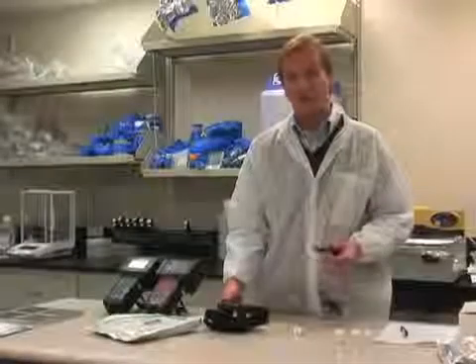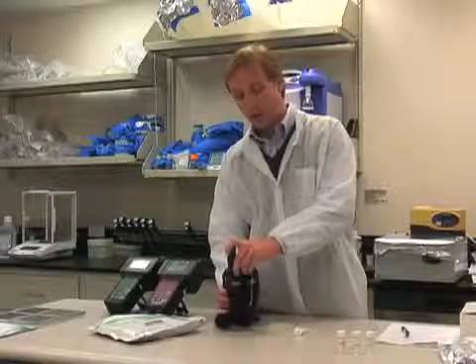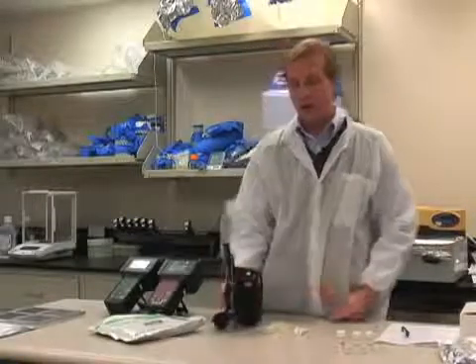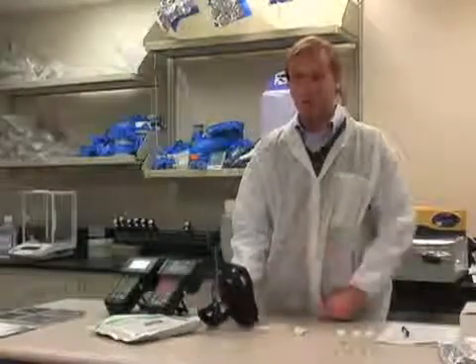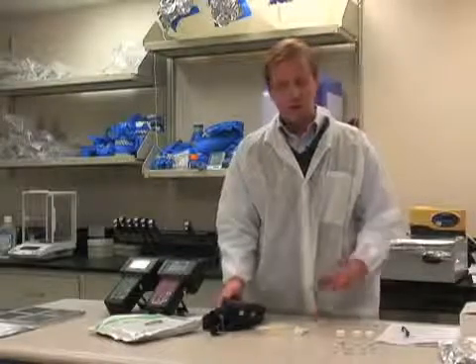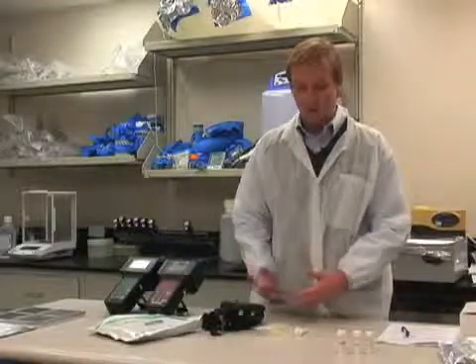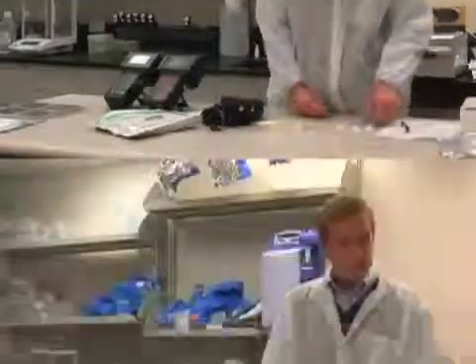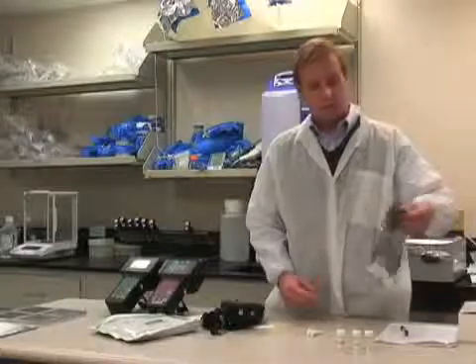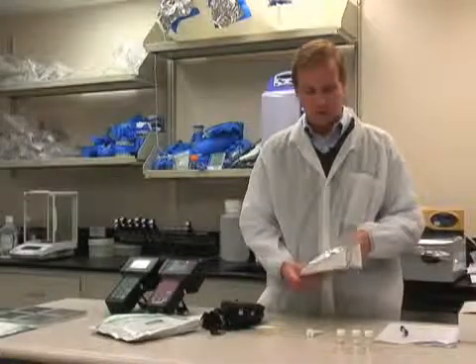So now that you understand how the Charm retrofit cap works, we're going to insert it into the Charm machine. Push it all the way down. Once inserted, the cap can stay there forever. It never needs to be removed. So let's now begin testing, doing the exact same test that we did with the Charm pocket swabs, now with the Snapshot product. So now I'm going to remove some Snapshot swabs from the foil sealed pouch.